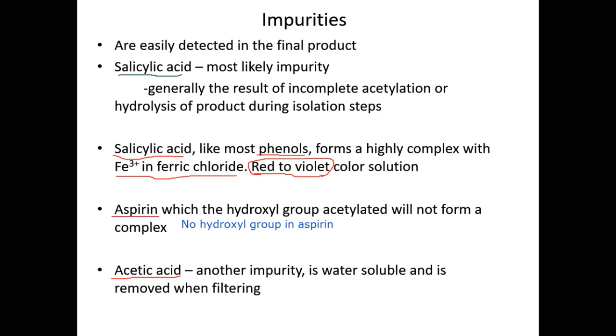The best way to remove the acetic acid is by washing it several times with cold water. So you would wash it, and waft to see if you smell the scent of acetic acid. If you do, keep on washing until no more scent is there, because this is a very common impurity which messes up the product. So when you make aspirin, acetic acid is a big byproduct of this reaction.